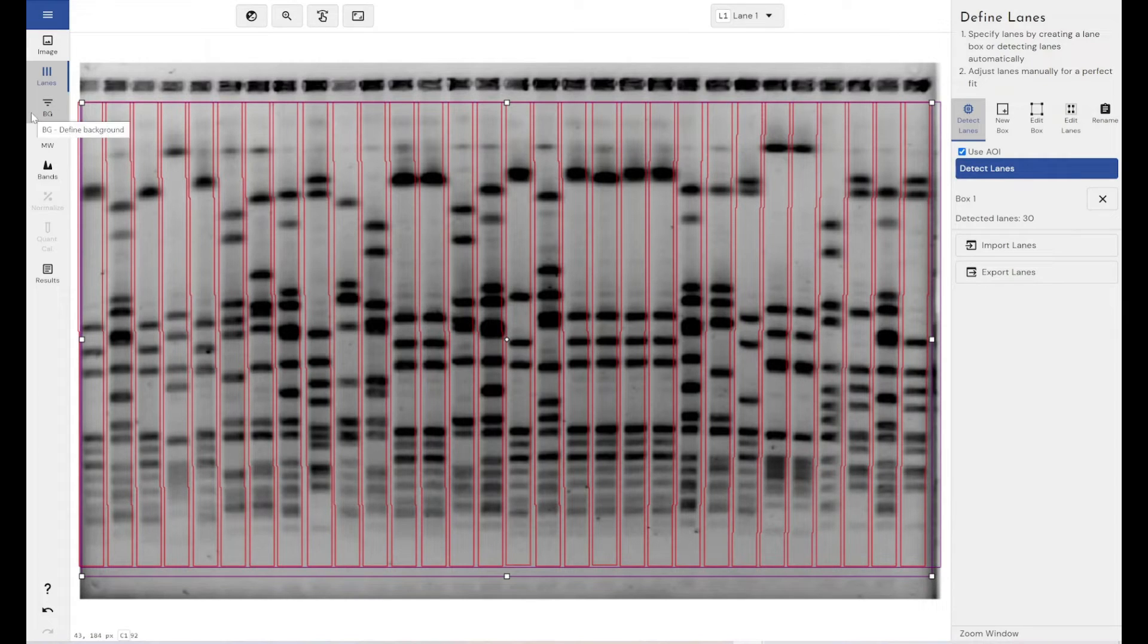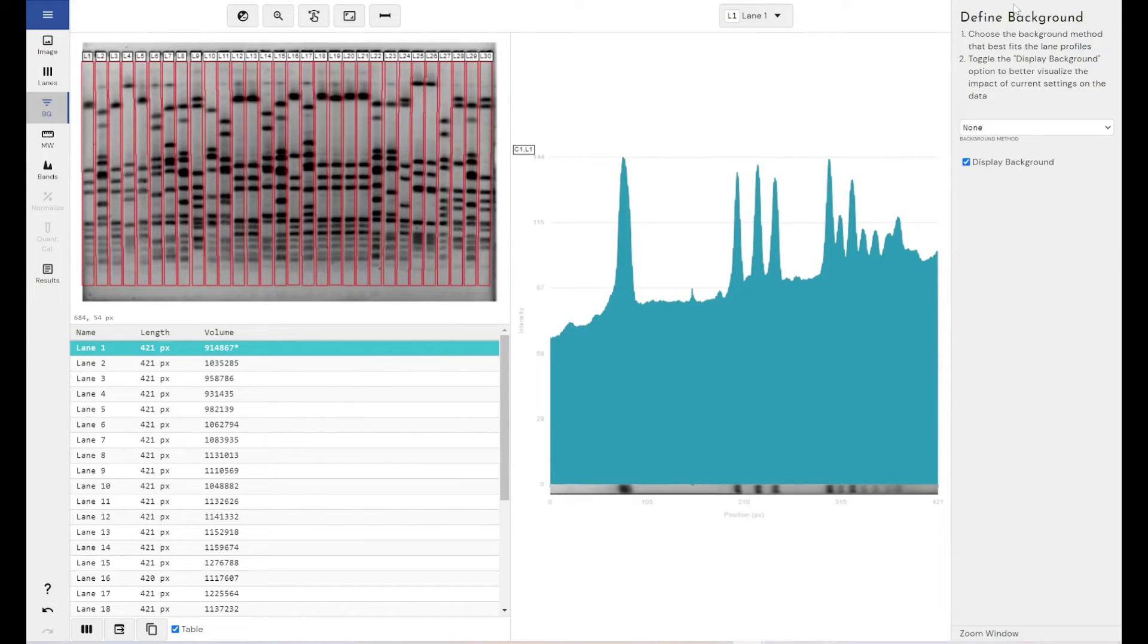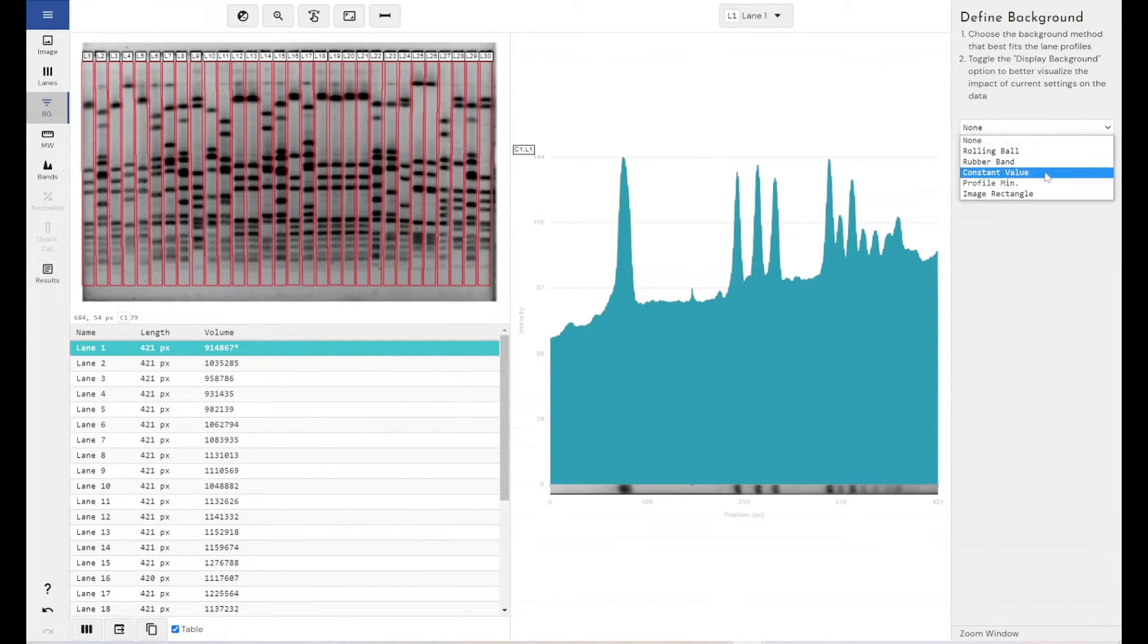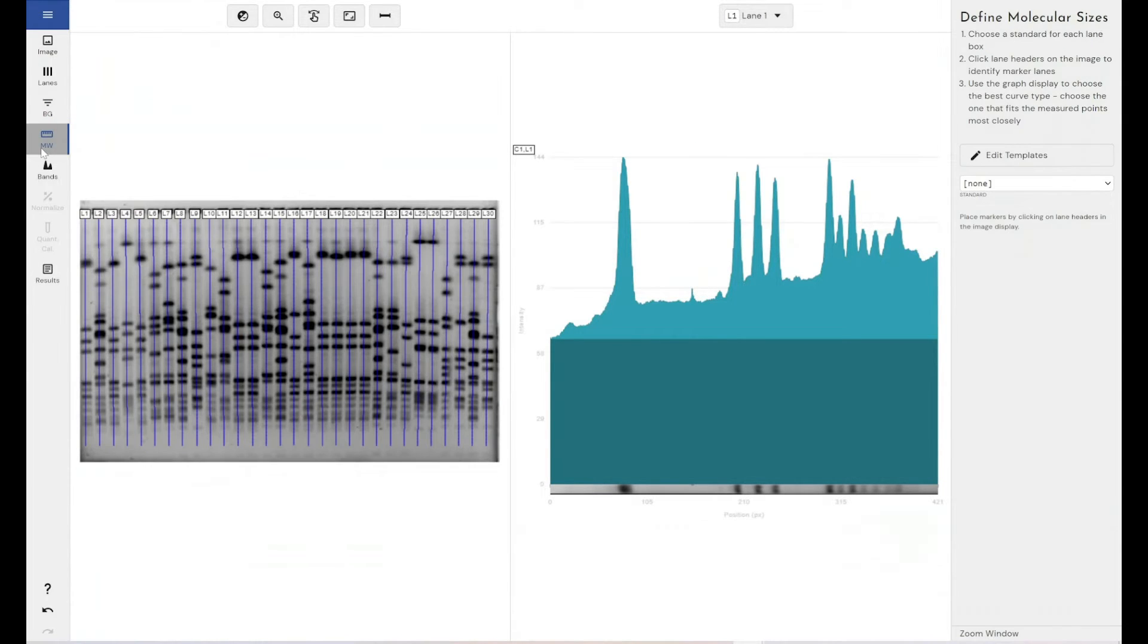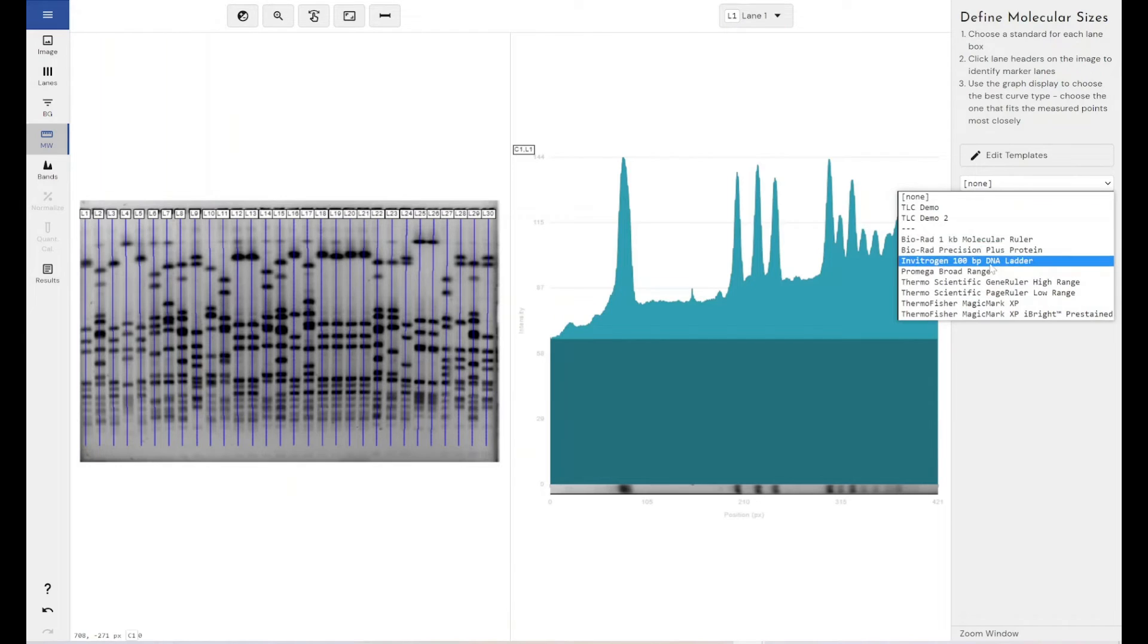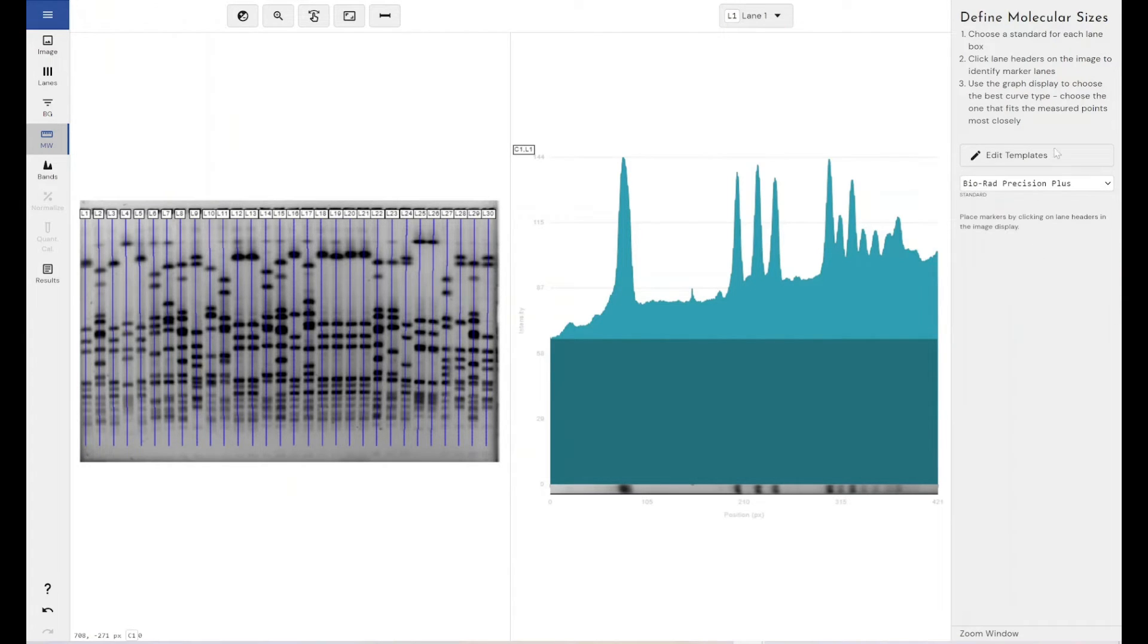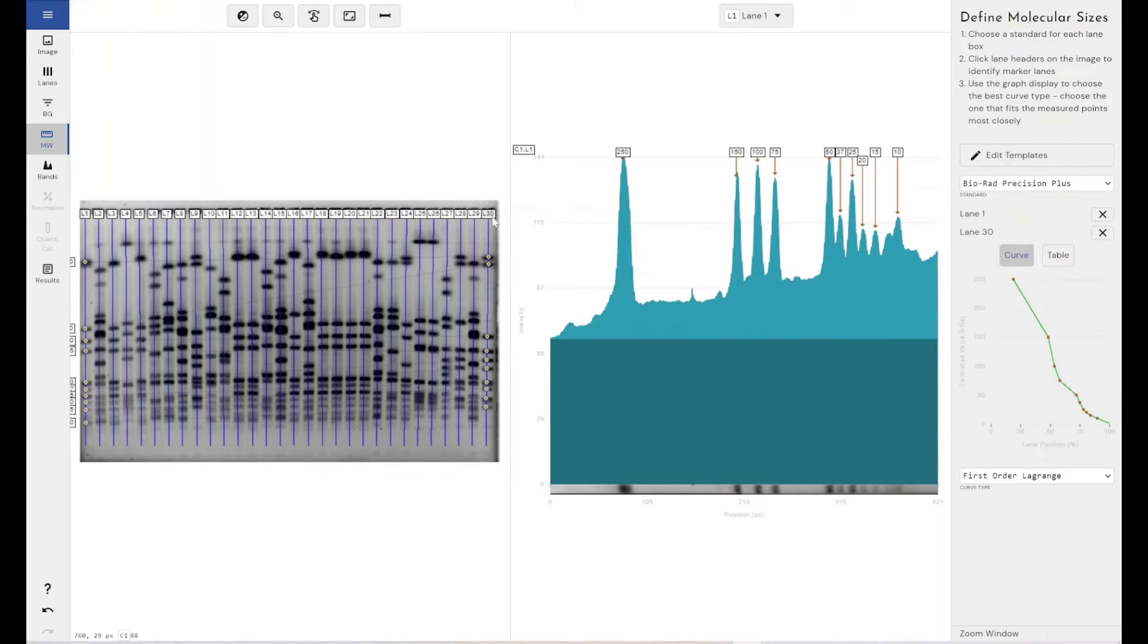And I'm aware these need adjusting slightly, but for this video I'm not going to go through that. My background detection method, I'll just call it, let's go for profile minimum for a change. My molecular weight marker, let's just grab a bio rad one, why not? And apply that on either end.